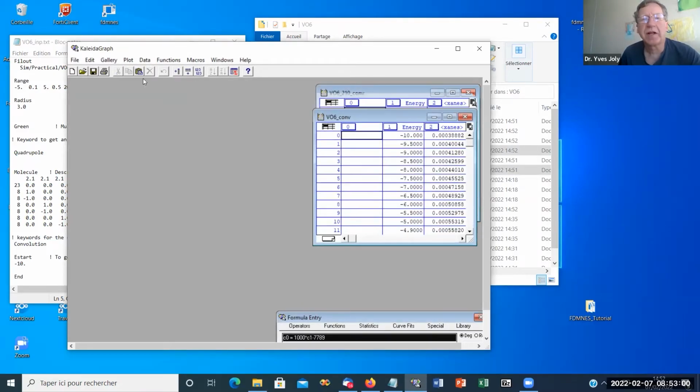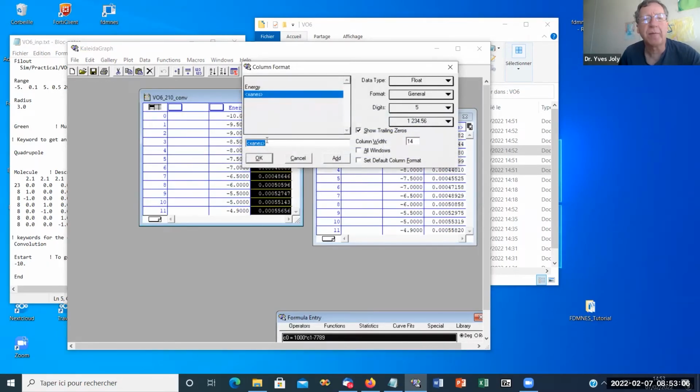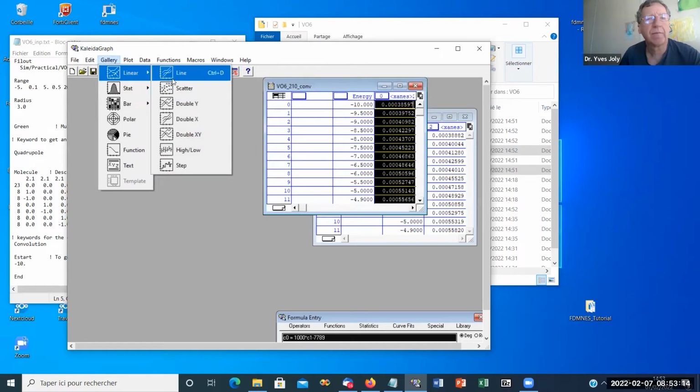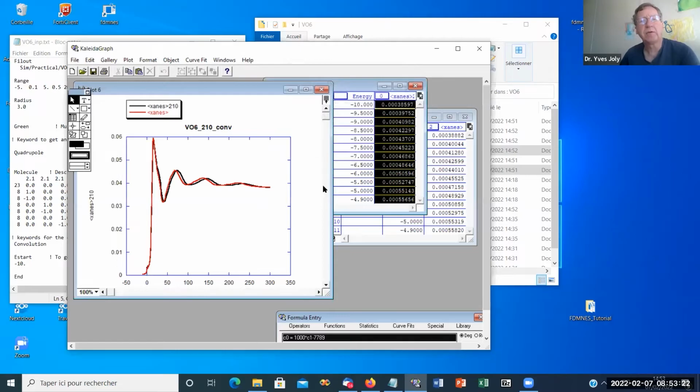So they are here. So this one is the contracted one. So to remember, I write in the title this. So I plot them together.